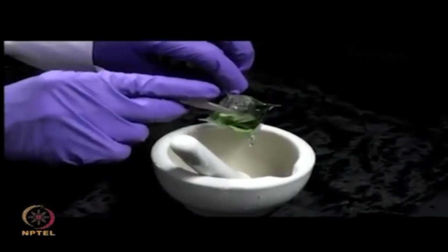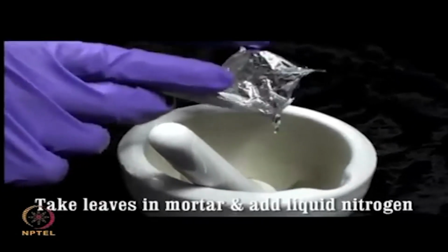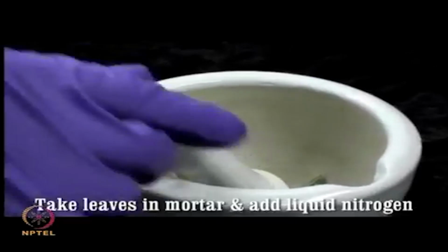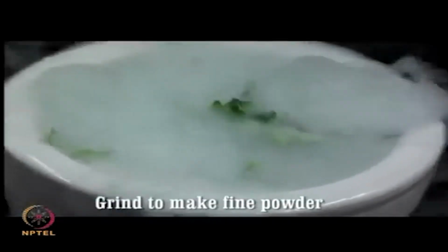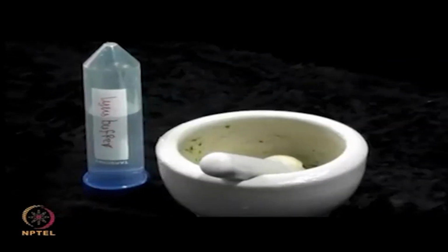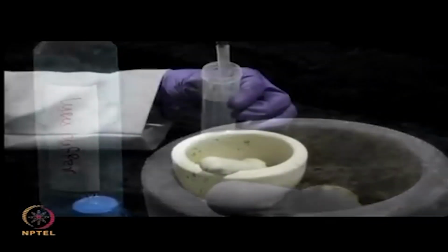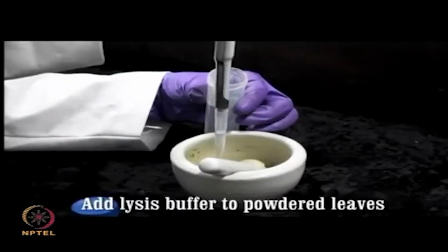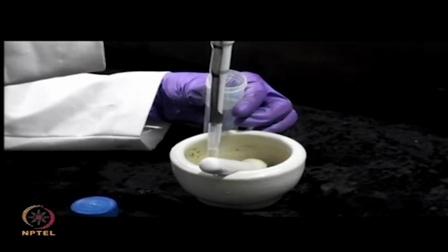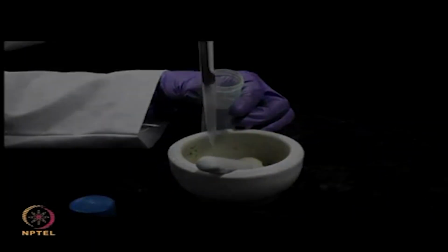Transfer these leaves to a chilled mortar and carefully add liquid nitrogen to it, which helps in drying up the leaves instantaneously. Grind the leaves well using a pestle to obtain a fine powder. To this powder, add around 0.5 ml of lysis buffer containing trichloroacetic acid, acetone and dithiothreitol, and grind it well until a fine paste is obtained.